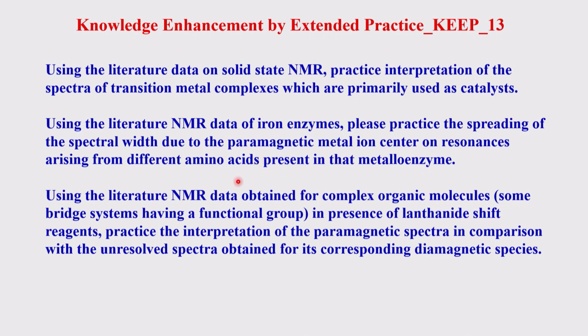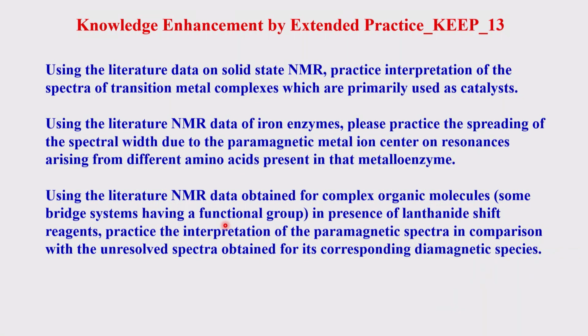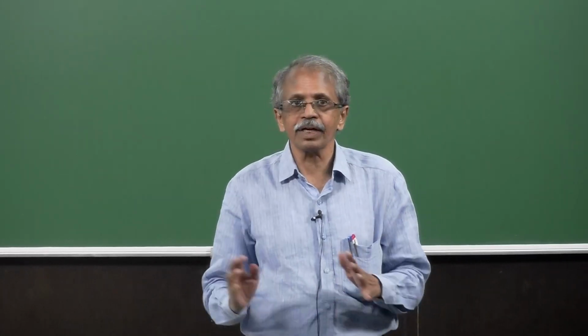Please do a practice. And also the last topic which I showed you, this shift reagents and paramagnetic reagents shifting, a lot of data is there in the literature. So please look into that as well. So do your practice for all of these: solid state NMR, NMR with the paramagnetic NMR, NMR shift reagents, which are used in a variety of applications of that.